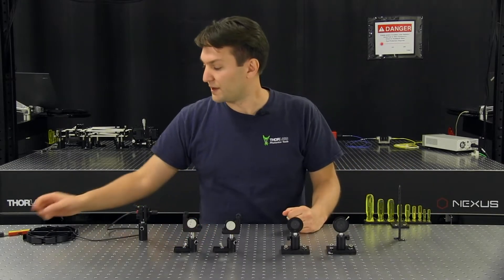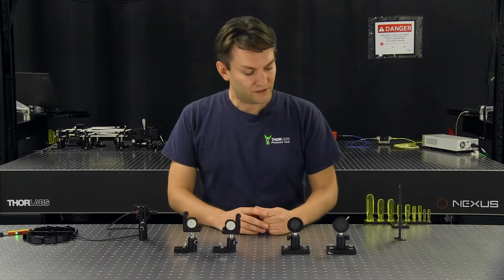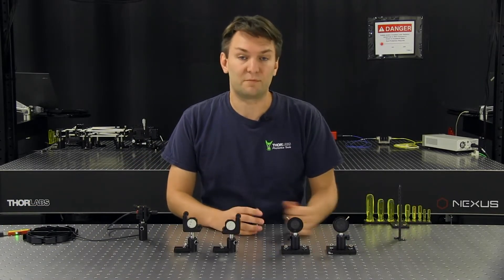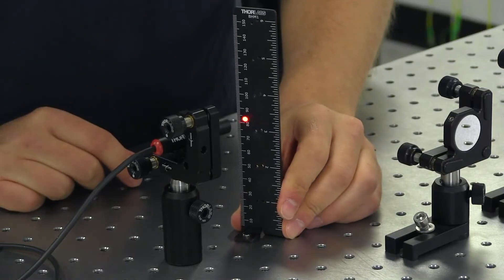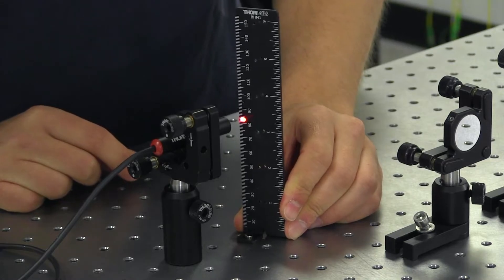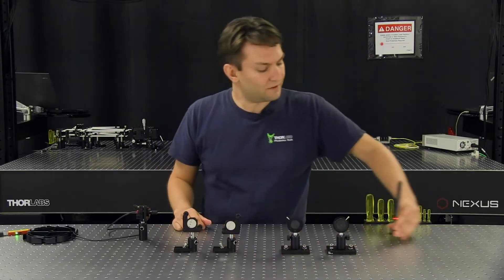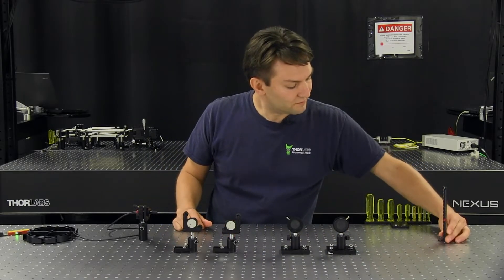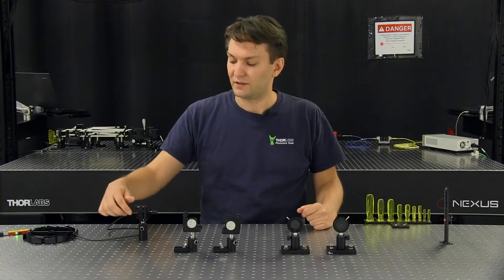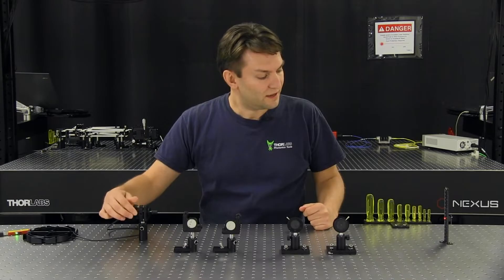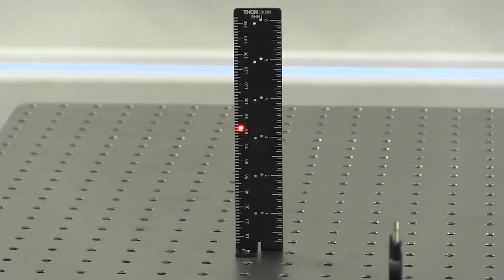So now that it's mounted, I'll turn the laser on. And so the first thing that I'll do is I'll take my ruler and I'll put it directly in front of the laser source. And so here I'll see that the beam is approximately 82 millimeters high. And so I'll take this ruler and I'll send it down the length of the table. And I see that I'm going in a downward direction down to 65 millimeters. So I'll adjust the tip axis and bring the beam up to approximately 82 millimeters.